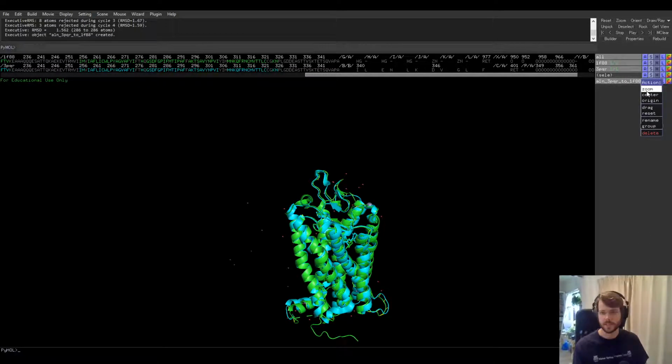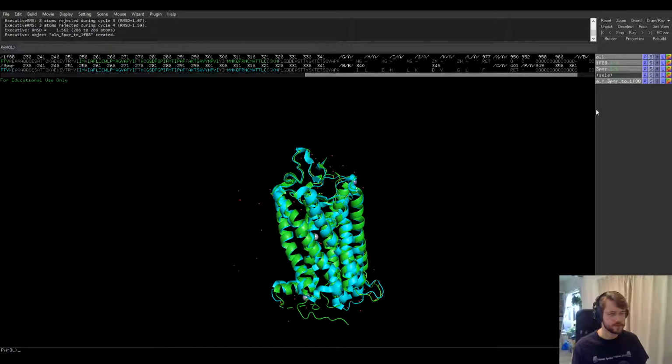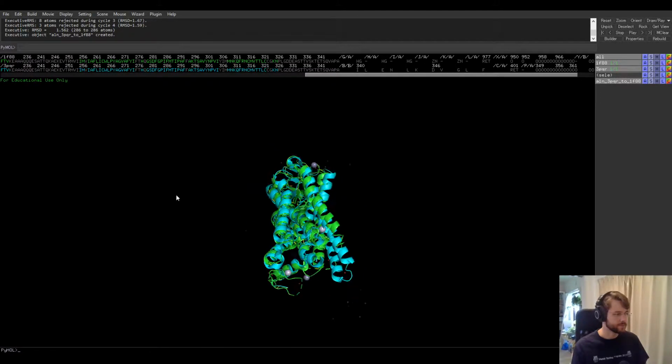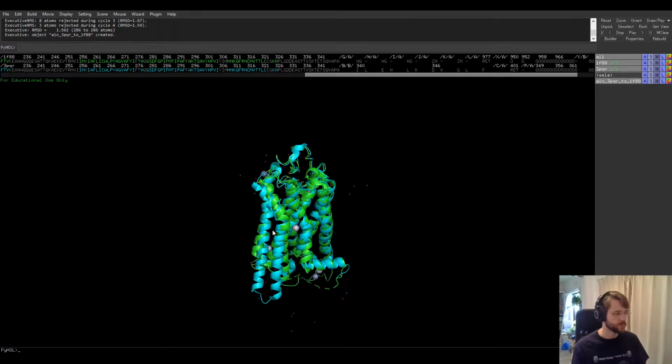That's why your computer does not have to... shift select by mouse. Shift select. Instead of dragging, yeah, that's true. Right. We center our view and we can see the protein, right?